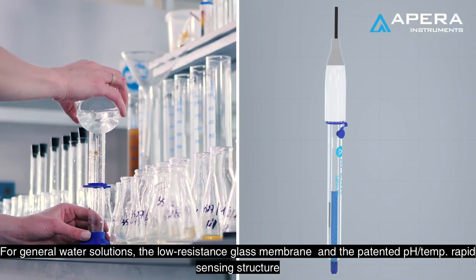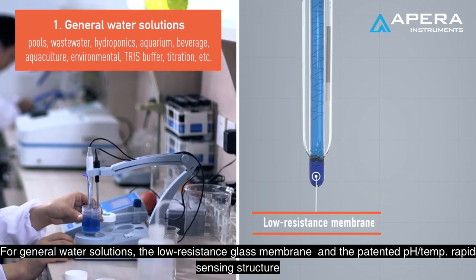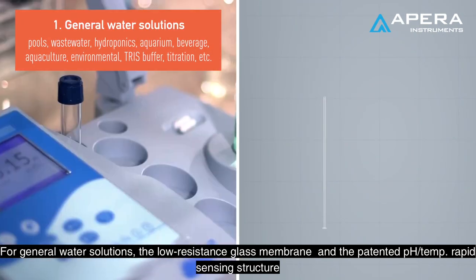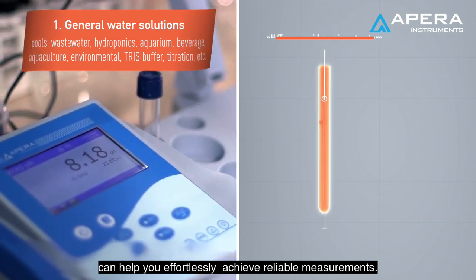For general water solutions, the low resistance glass membrane and the patented pH temperature rapid sensing structure can help you effortlessly achieve reliable measurements.